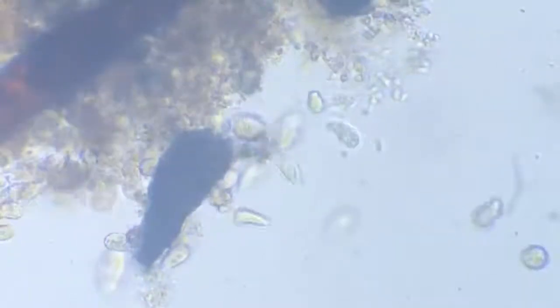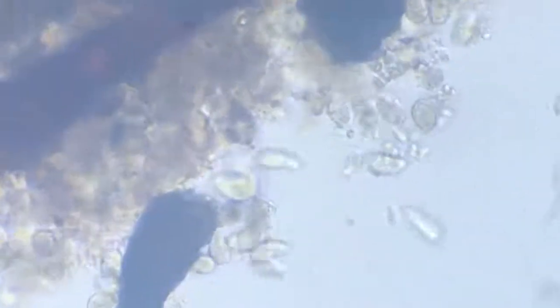What is that congregation? So do you see them? Well, they are right in the center, those little specks.